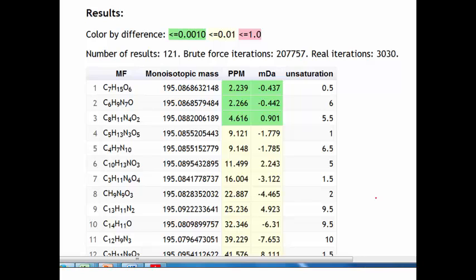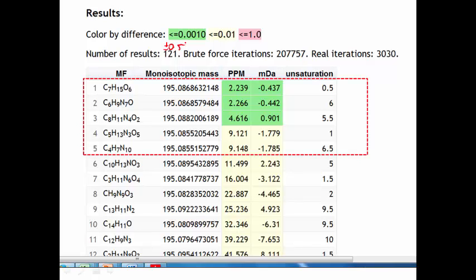So this is the short list that we have right now. There are 121 that are within plus or minus 0.5. But we can do a lot better than that. We know that we're only concerned with those that are within 10 parts per million of the mass that we have observed. And there are only five possible formulas to work with.